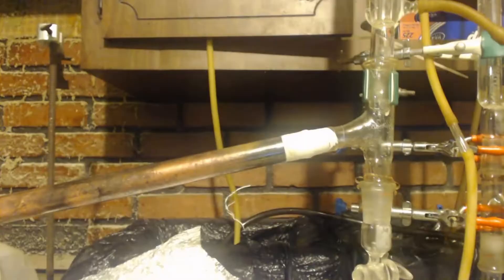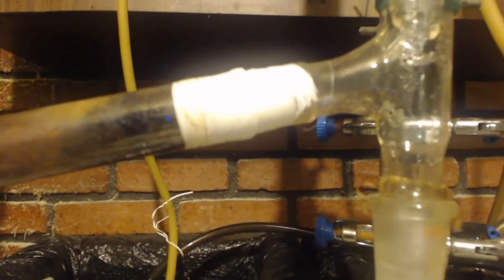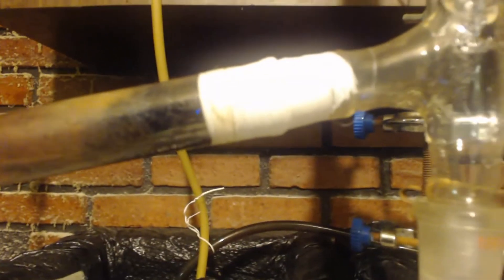I had one leak right at one of the connections. I've had this experiment running for hours and hours several times trying to get it to work. I only had that one leak — I just pushed the steel head and furnace tube together a bit and put more Teflon tape around it until the leak stopped. That worked pretty good and it's been working ever since.